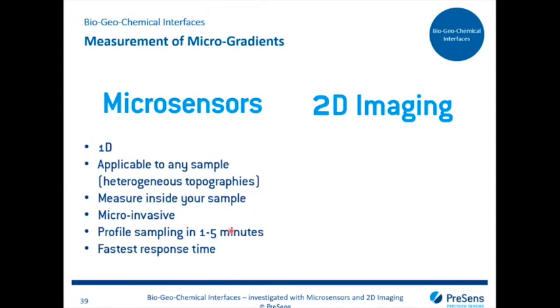The profiles themselves, if we talk about time resolution, take about 1 to 5 minutes. And especially the oxygen microsensors show a really fast response time, meaning that if you want to measure on a certain spot, you can capture very fast dynamics on the seconds or even milliseconds level.